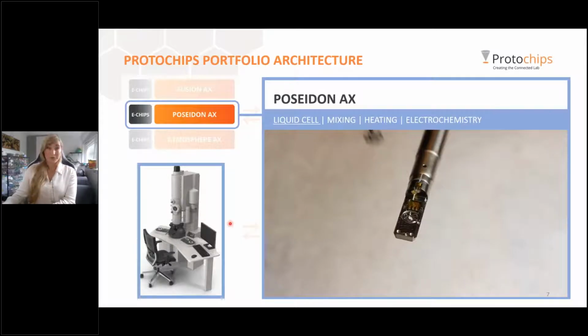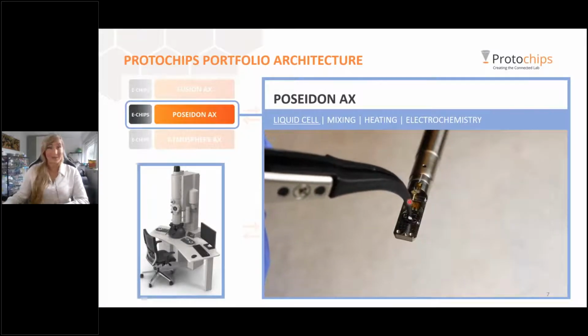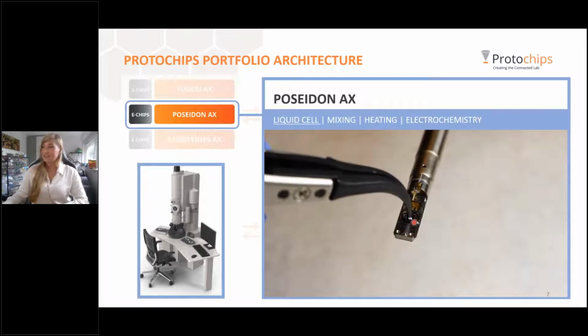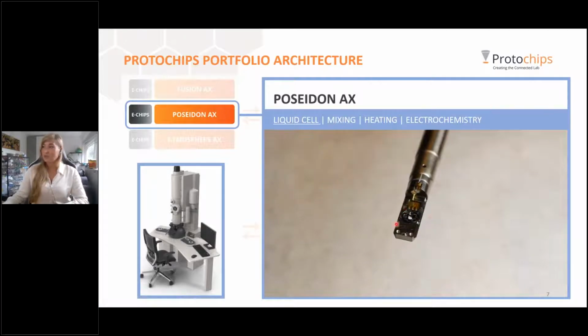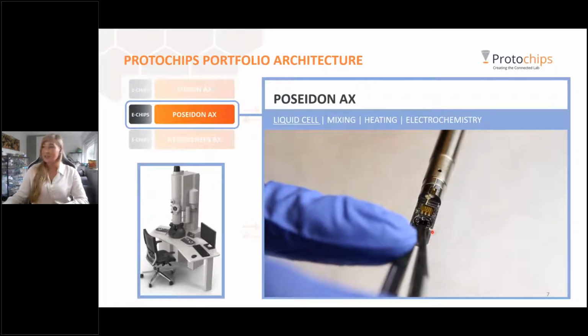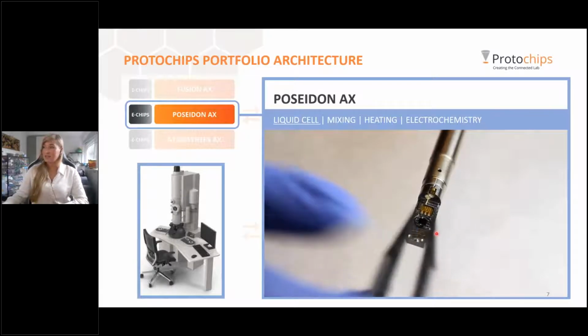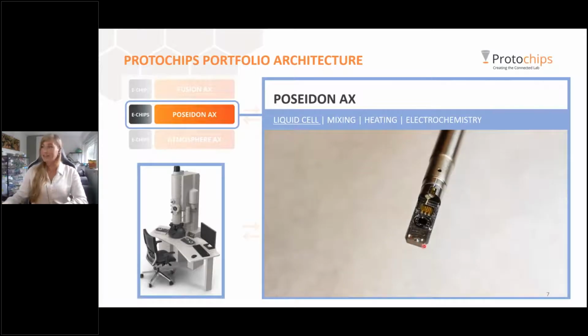Well, that's a beautiful rendering, but it's also nice to see what this looks like in real life. So this is one of my colleagues assembling the cell. You can see how tiny everything is. The bottom chip, the small chip, is only 2 by 2 millimeters. So you can see how much precision you need to put this together. This is why we've made sure that the holder has almost everything together already, so you don't have to do any alignment. You basically just put the chips in and they're already in place.